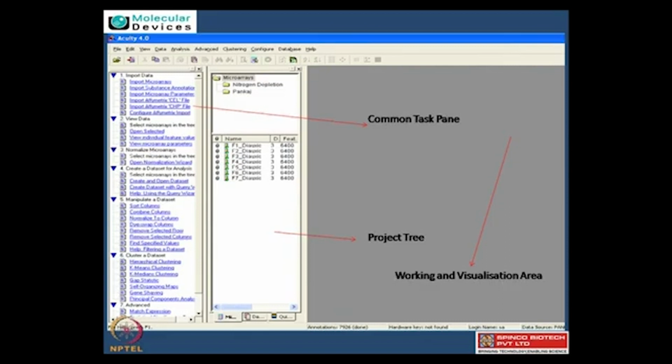So I think it just guides you step-wise, showing how you can walk through the entire process. True. It gives you, right from the input to the analysis, a step-wise view of what all you can do and what you want to do. Towards the middle, what you see is a microarray root directory which houses all your data in different formats.